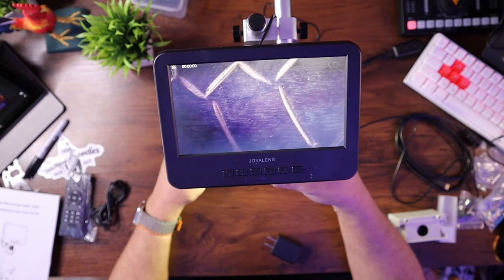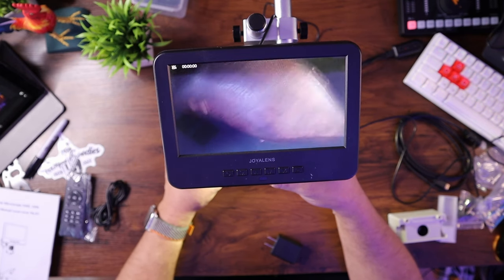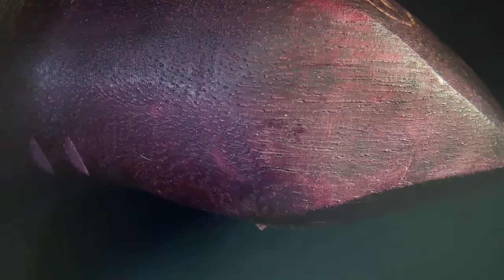Let's try a couple of things on my desk — how about Mr. Turtle that everyone seems to like? Let's check specifically how well detailed the grain of this turtle is. Getting right down there into the grain — that looks great.